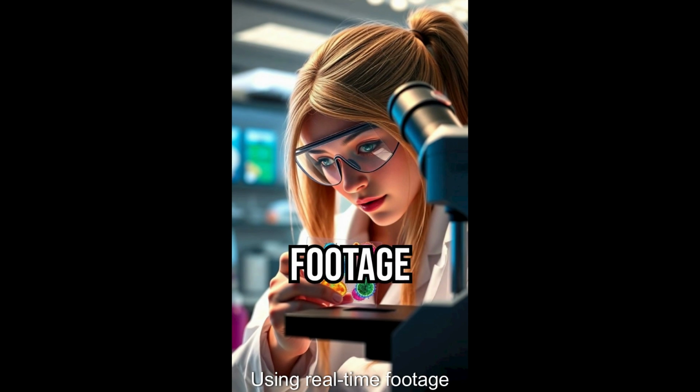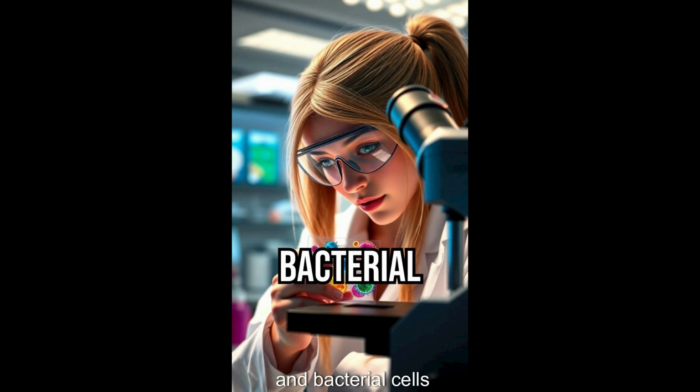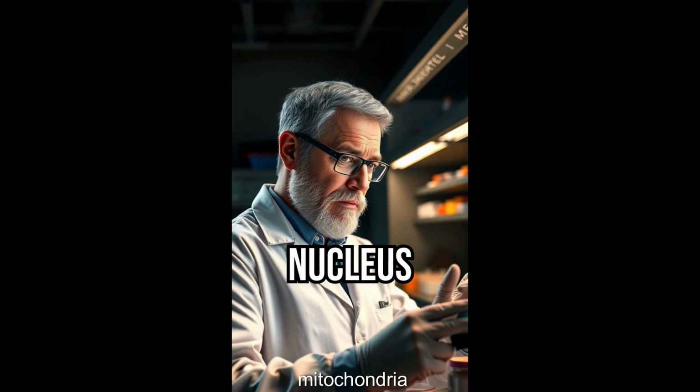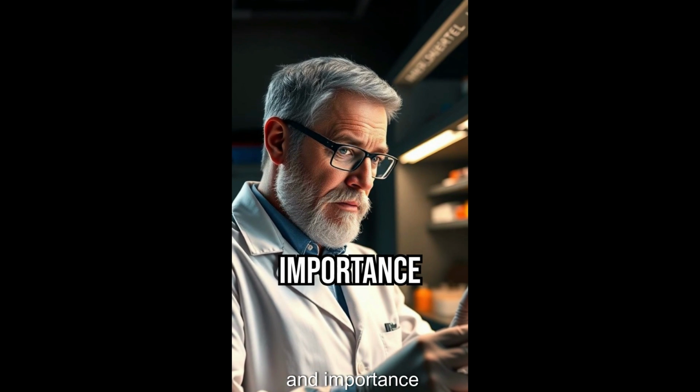Next, we'll journey into the world of cells, the building blocks of all living organisms. Using real-time footage, we'll examine various types of cells, including plant cells, animal cells, and bacterial cells. You'll see cell structures like the nucleus, mitochondria, and membrane up close, gaining insights into their functions and importance.